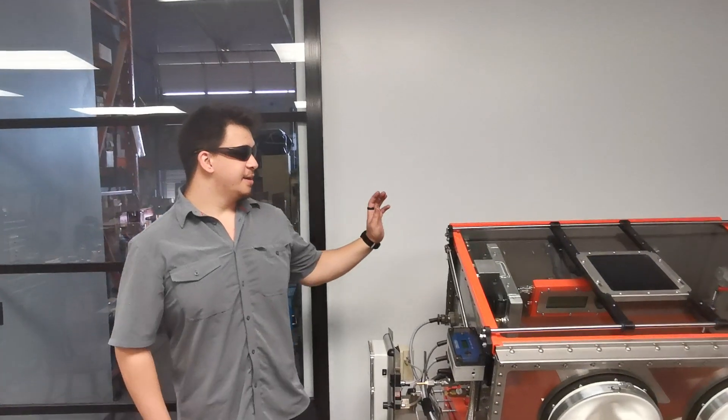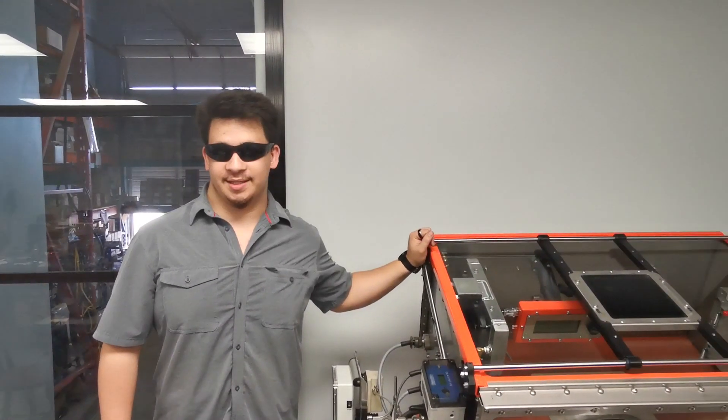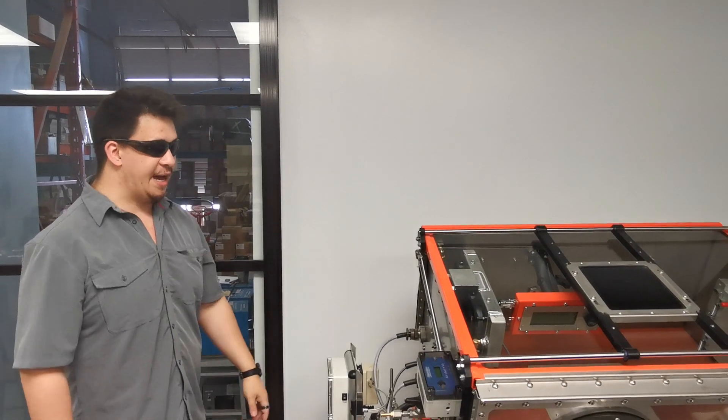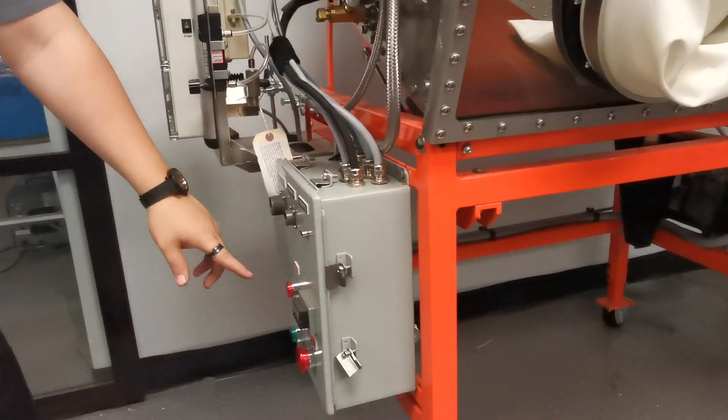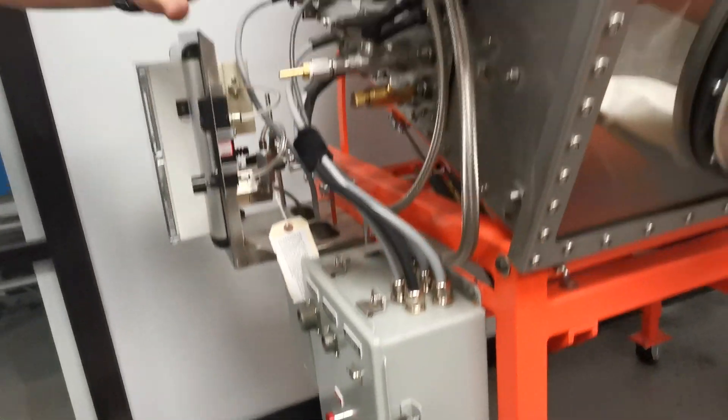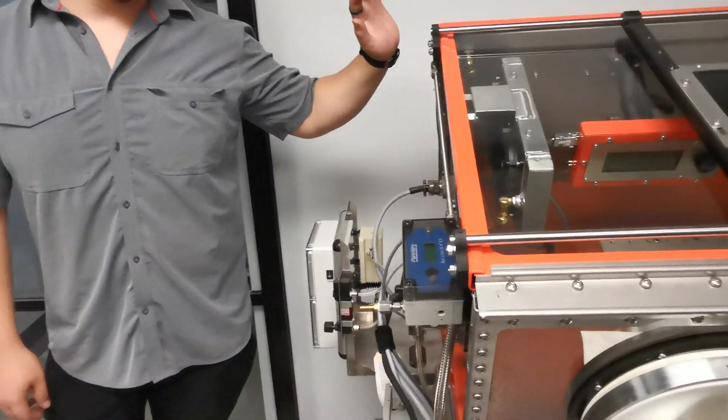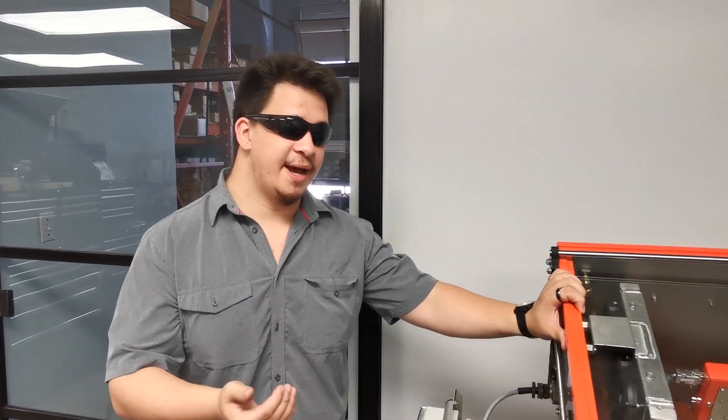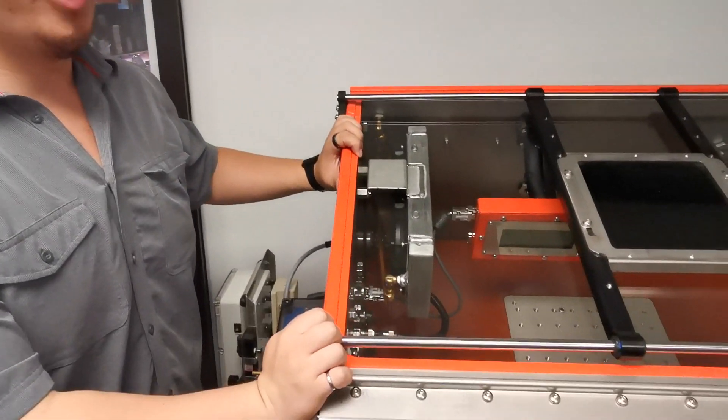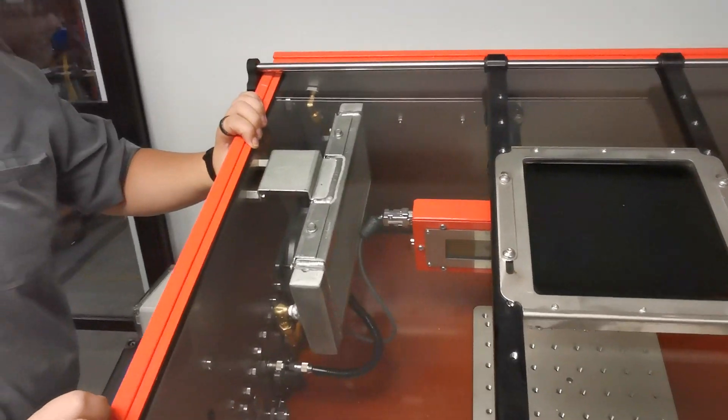So this is our inert chamber glove box system which is fully integrated with our ESD power supplies in terms of power operations. We have different methods for how low of an oxygen percentage you need, how to move parts in and out, and allows you to work on components that require very low oxygen levels.